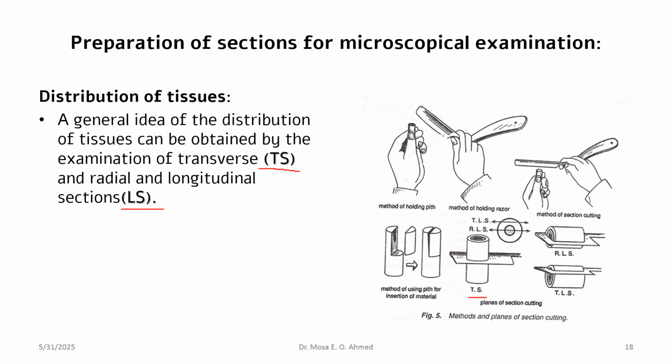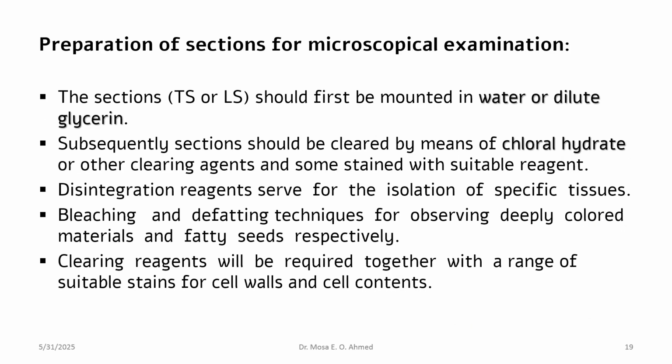or we use a vertical line to obtain a section, as appear in these pictures. After preparation of the L section and T section, the sample or the section should be mounted on water or dilute glycerin to preserve its structure and to aid its visualization.